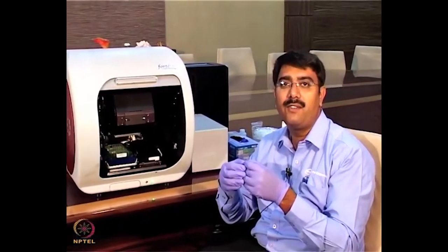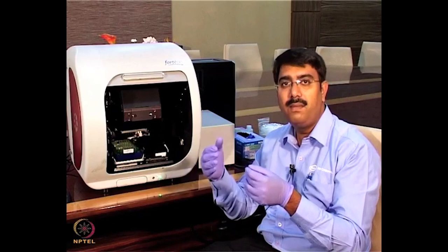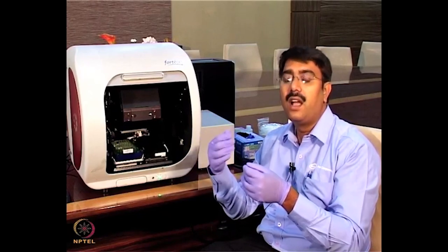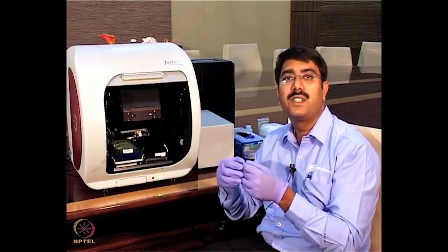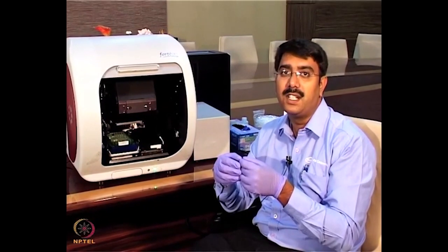The change in the wavelength, as the concentration increases, corresponds to the optical thickness. The more the optical thickness changes, as we can see from the change in the wavelength, it indicates that more molecules are binding. So from this we can determine the concentration. This instrument is useful for quantification. Suppose in industry, for any protein, if you want to do quantification, we can directly take known concentrations of standards, generate a standard curve, and from that determine the unknown concentrations. Apart from that, the major use of this instrument is to study binding kinetics, where we determine the rate constants like on rate, off rate, as well as the affinity constants.